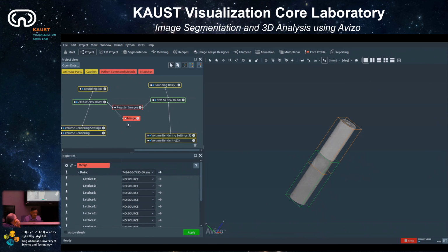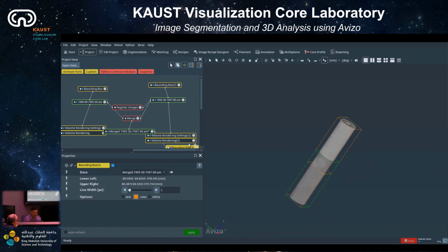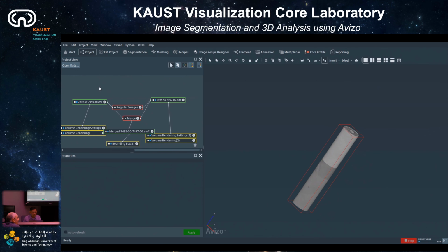So with new data merge, you get the kind of data that already... it's kind of manual work, but yeah. So now if you attach the bounding box, maybe in red, you will see the new object here. Is that okay so far? Like this. So look at the new data set.